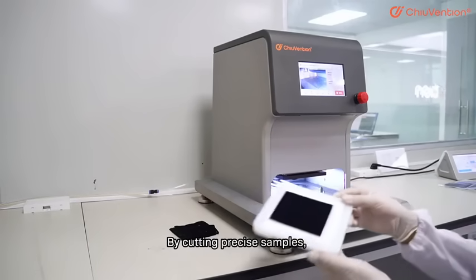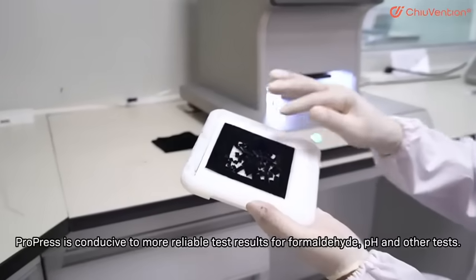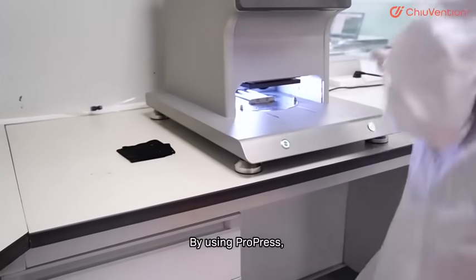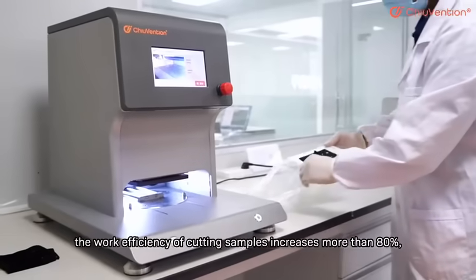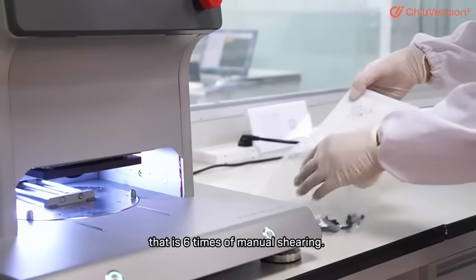By cutting precise samples, ProPress is conducive to more reliable test results for formaldehyde, pH, and other tests. By using ProPress, the work efficiency of cutting samples increases more than 80%, that is 6 times of manual shearing.